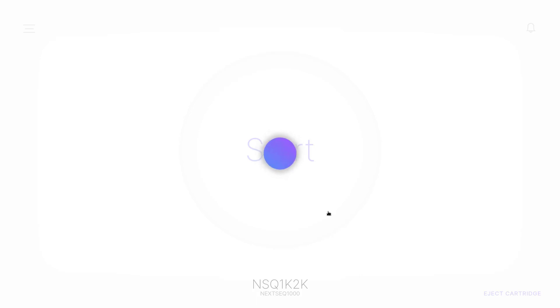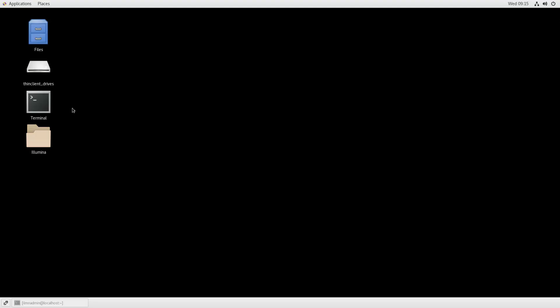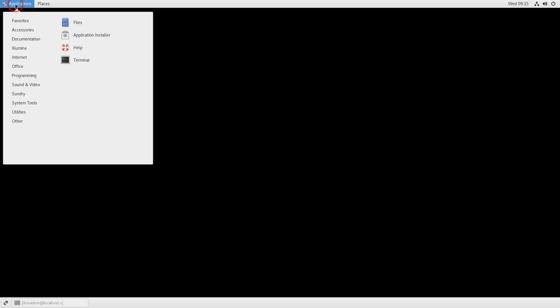Then, launch the terminal by selecting Applications and Terminal.